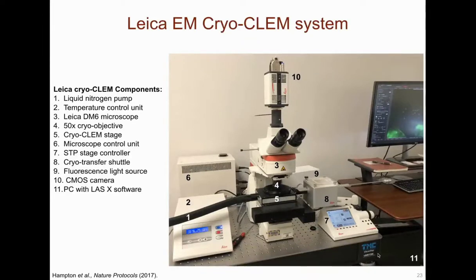For our work, we have had great success with the Leica EM Cryo-CLEM system for studies of bacteria, human cells, and virus-infected cells.